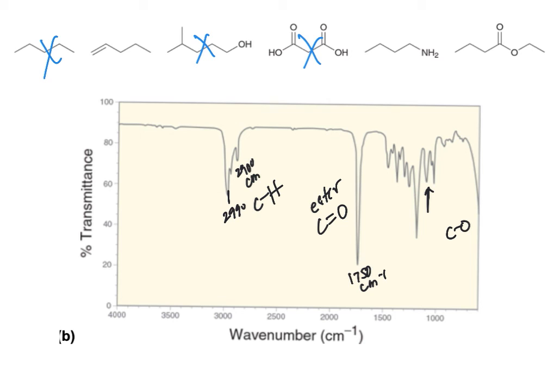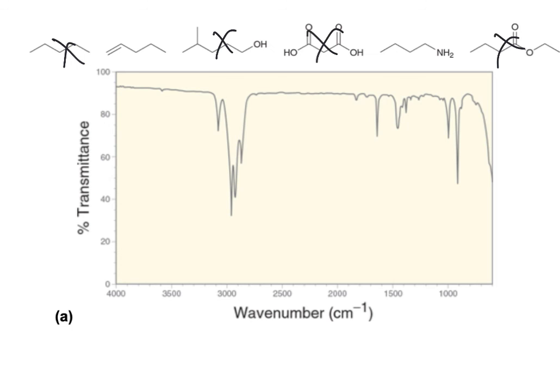Now, you're not always going to have a molecule choice, but again, just because of where this hits and the fact that there's nothing else, you only have CHs, it's a good indication that that's your molecule for a carbonyl. Okay, let's do this again. You're only going to get better at this the more we practice it. That 2990. Again, you should know now that those are CHs. And then there's really not much else. Maybe we could say this one here looks like it's right around 1600 wave numbers.